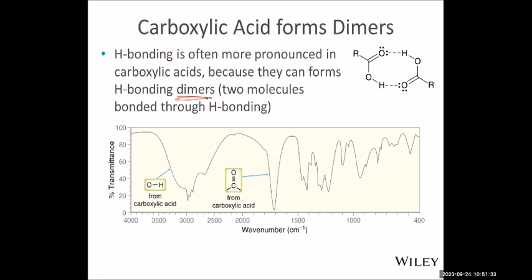Take a sample of the reaction mixture, measure, and observe around the 3300 wave number absorption. If you still see a fairly significant, strong, very broad absorption, that means you still have quite a bit of reactant not reacting. So keep going, give more time. But if you see it is almost negligible at the 3300 wave number, that means the OH reaction is fairly complete. And keep in mind, in real organic chemistry, we almost never wait until the reactant is 100% reacted. It's just because the reaction takes long, and also gets slower as the reactant is being consumed. So it's about degrees of how much reactant is being converted.